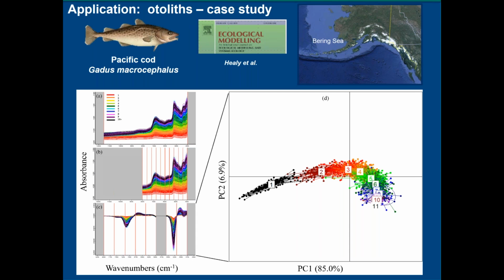The question you're asking, I think in theory has a fundamental basis, as we've been talking to Oliver Thomas about this. But that certainly is a big topic that we are pursuing at the moment, because we have hired Oliver Thomas as a postdoc to actually help us extract and identify some of the molecular constituents, or the proteins specifically, that are related to the wave number information that we're getting from the spectra. I know that's not exactly the answer you want to hear in terms of what I know, but it's basically what we're doing. And I'd say the answers are yet to come.